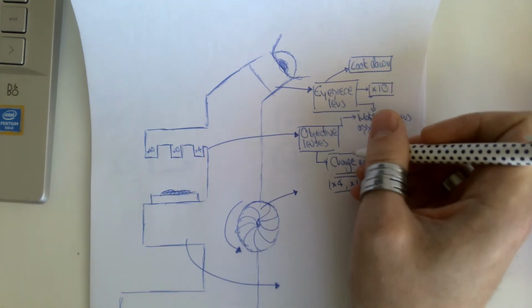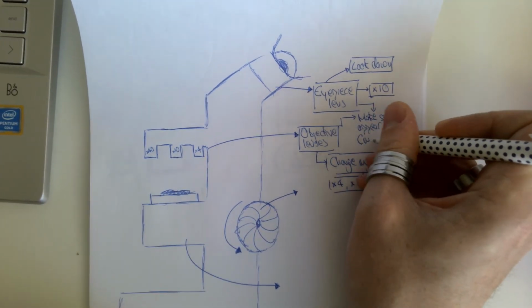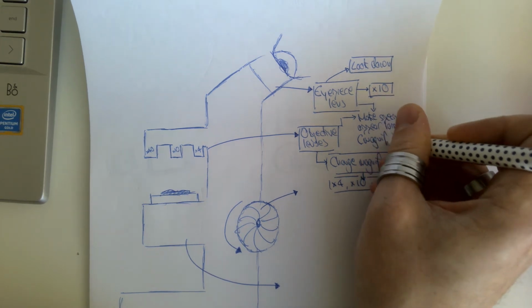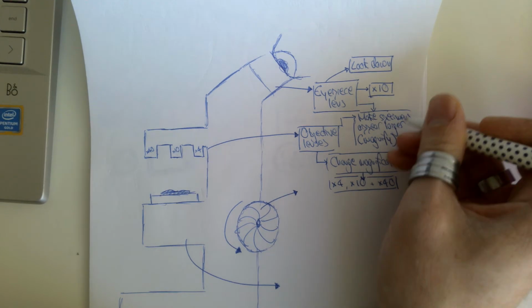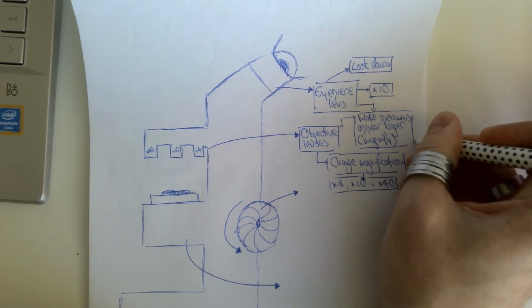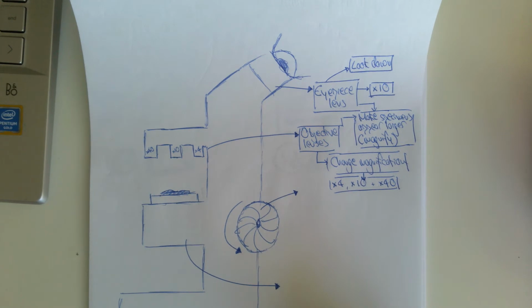So, in other words, they are magnifying the image that you see. Okay, so those are obviously the lenses.